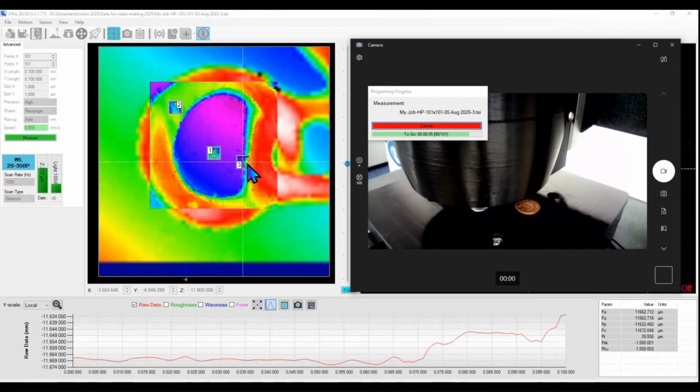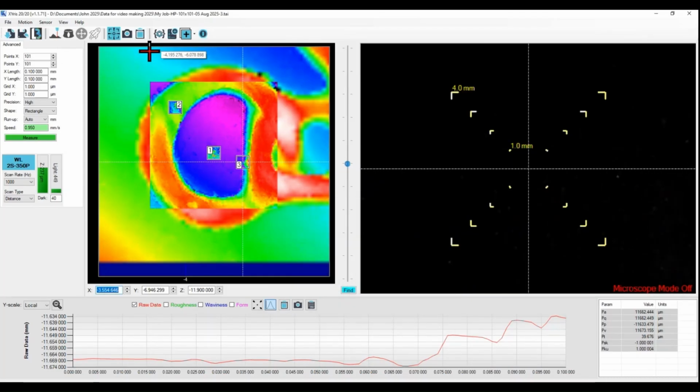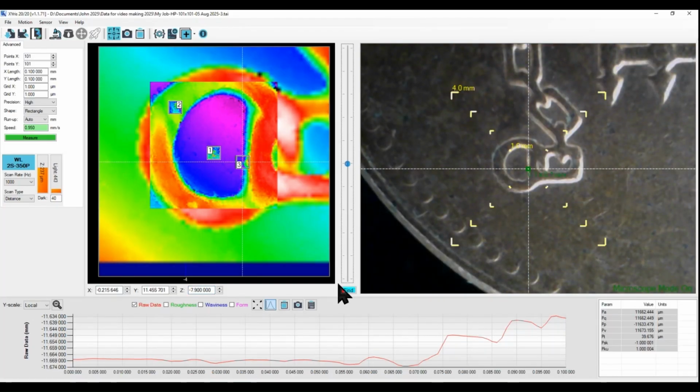Okay, let's finish that off. That's 3. And that's now completed. If I were to just switch back to the, let's reduce that. Let's switch back to the microscope mode and bring this into focus. You can see that last box, I think it's just about visible at where my pointer is on the edge of this feature here.